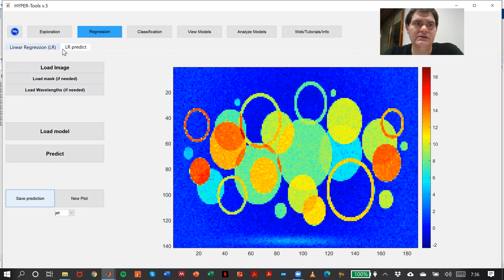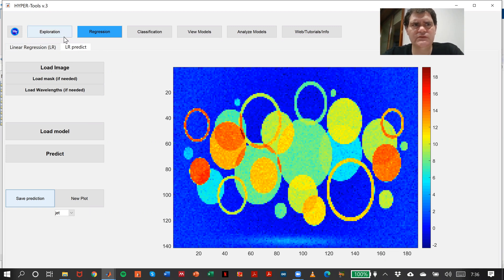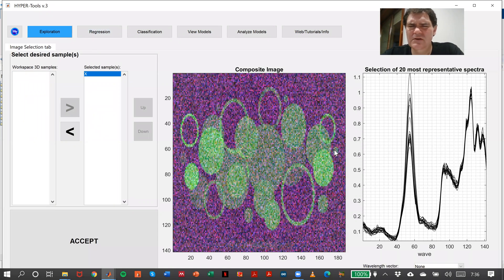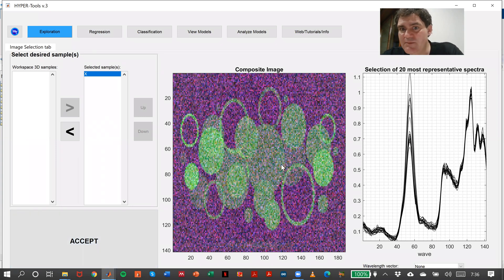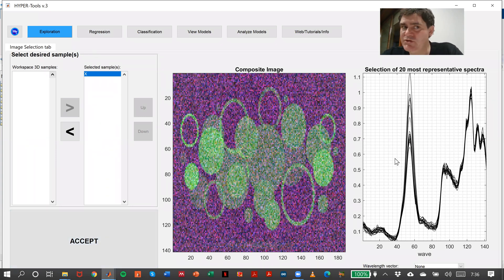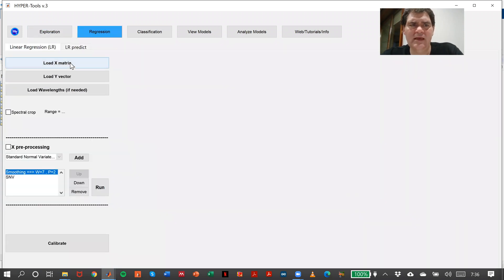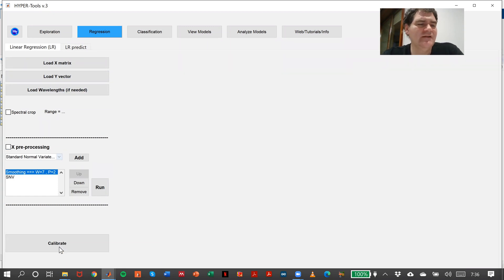Now if you want to change anything, you can do it. Imagine you're not convinced of this preprocessing. First, what you can do is come back to exploration, and in the original image maybe first derivative is going to work better. You could try what happens with first derivative on the exploration image.